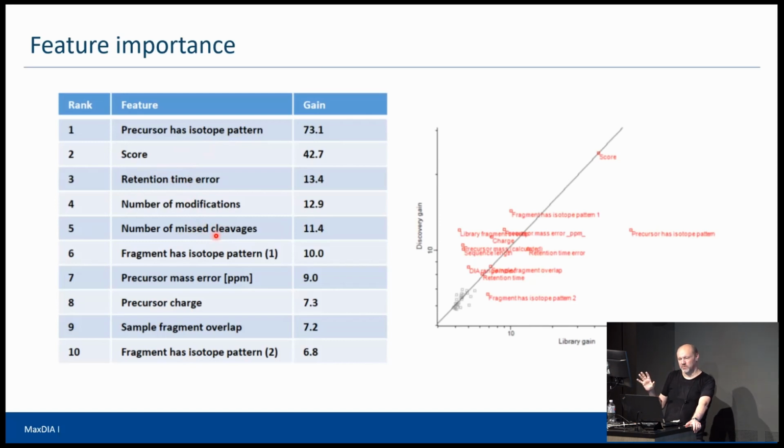So it's not so much from the matching that it is wrong, but it has a smaller a priori chance to be the correct identification, like in a normal proteomics run where you try to keep the number of miscleavages low. And then if you find a peptide that has actually 3 miscleavages, then it's actually less likely to be correct than an alternative interpretation where you wouldn't have any miscleavages, right? So that's why this also shows up here.